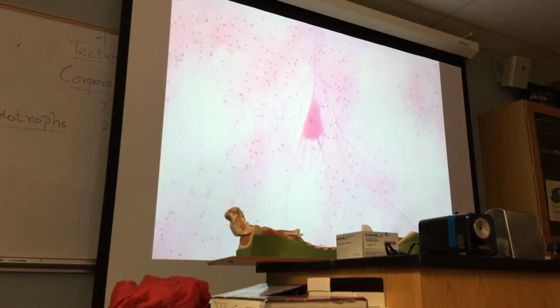And this region is called the axon hillock. Got that? And can you see this axon? The first part of the axon is called the initial segment of axon. You get that? This is the axon hillock, and the whole thing is axon. You can see branches from the axon. Can you see that branch? It will be clear when I magnify further. That is called axon collateral.